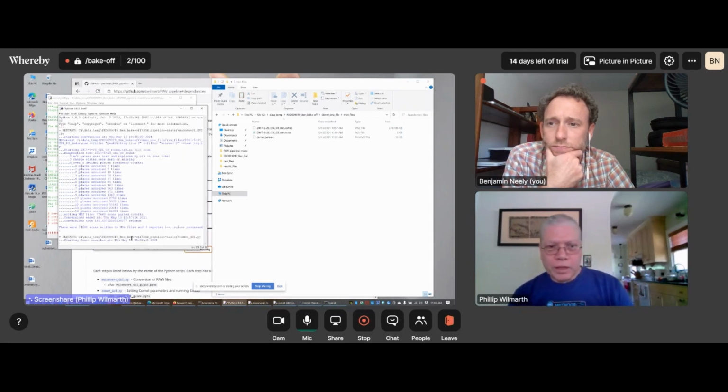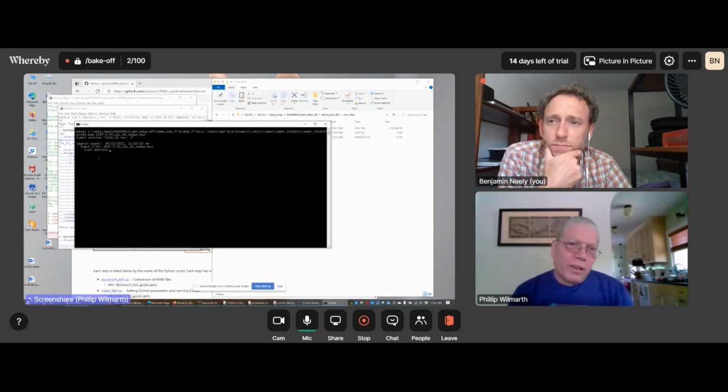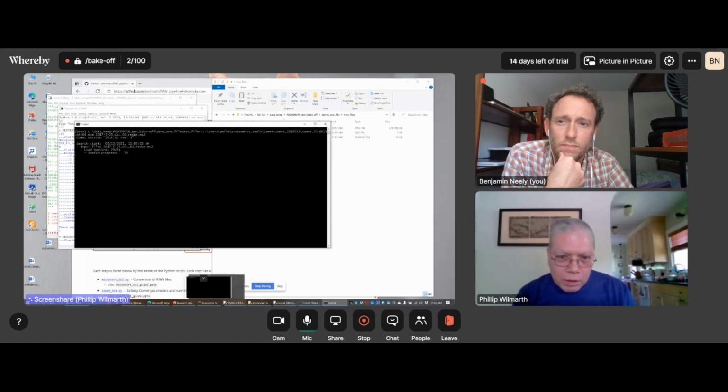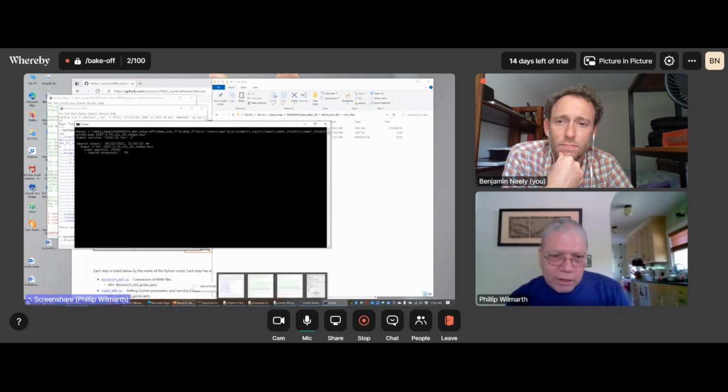And again, the console window tells us we started Comet, and now we see we've got a Comet Windows command window up. First thing it has to do is load the spectra. These files have about 70,000 MS2 spectra per LC run, so it takes a while to load that in. And we see the search here is going to take about 3 minutes to run at this rate, but it's chugging away. Let's see if we've got anything else back at GitHub that might be useful.